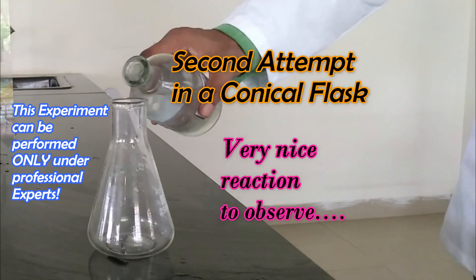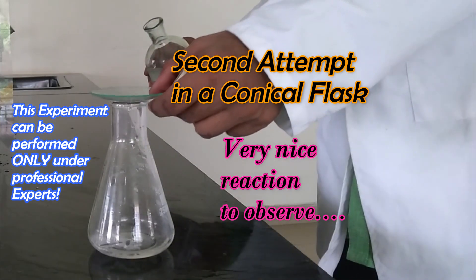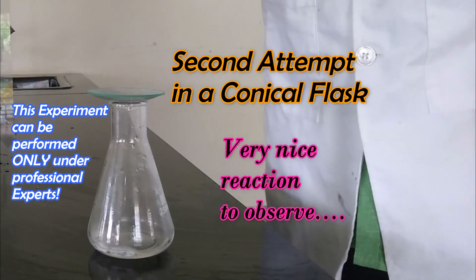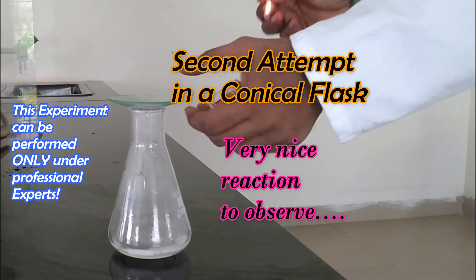We are adding hydrochloric acid to the magnesium strip in a conical flask. We cover it so the hydrogen gas does not escape. We bring our burning match to the mouth of the flask.